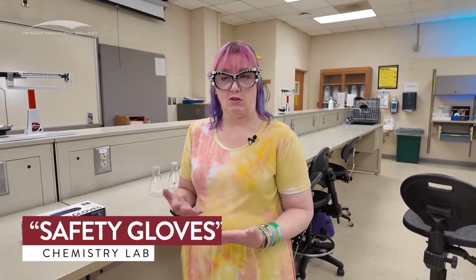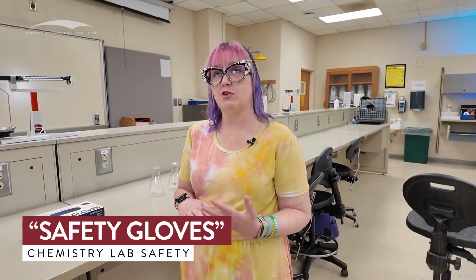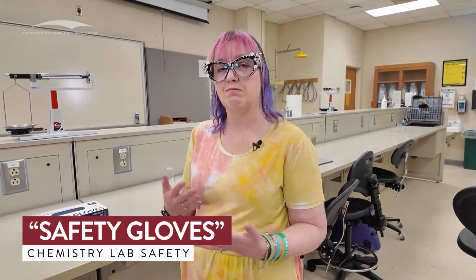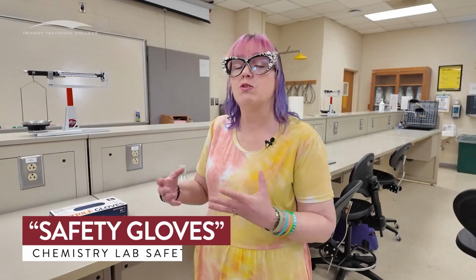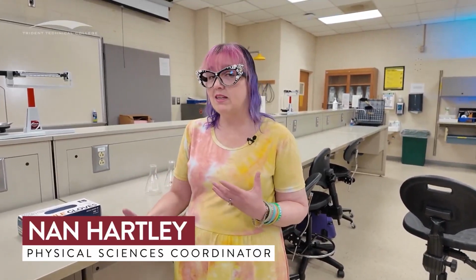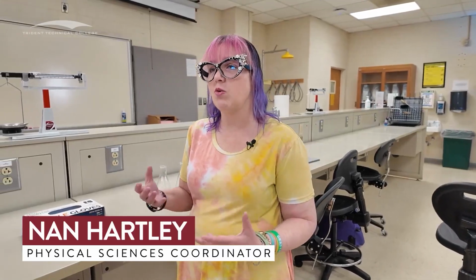Good luck. So we've got a couple of experiments where we specifically need to be worried about our glove protocols. Those experiments are the solution concentration, the titration standardization, and the titration for the vinegar concentration. For those experiments, it's absolutely necessary that we wear gloves for the entire experiment. For the other experiments, gloves are recommended. They're not necessarily necessary. It's never that we don't want you to wear them, but you don't have to wear them for the other experiments.